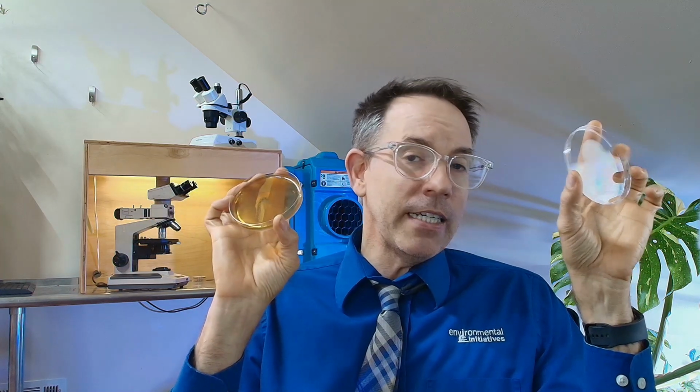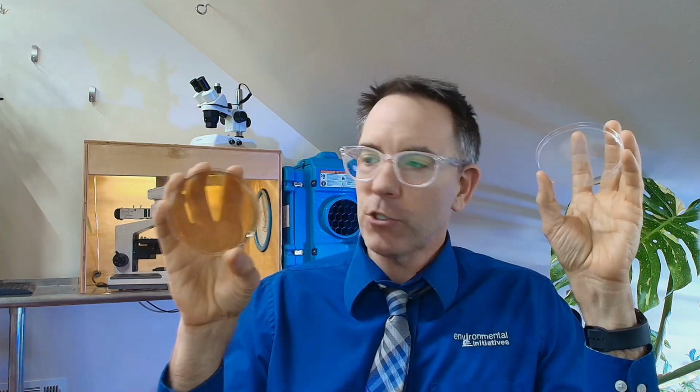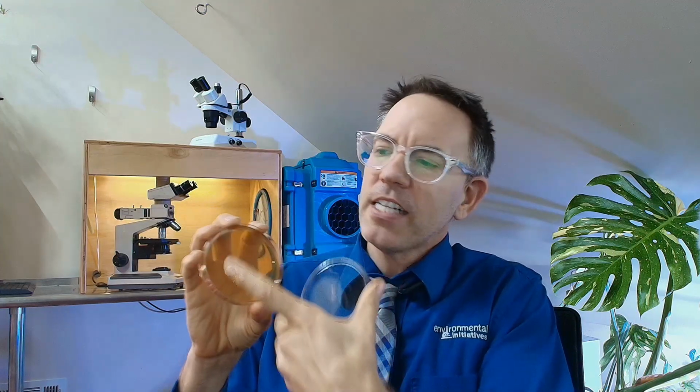Okay, so normally when a person's going to take samples for sewage bacteria, they're going to be using a sterile swab and sterile water. They'll wet the swab and they'll swab the surface and send that swab to the laboratory. The laboratory will then extract the bacteria off the swab and put it onto a petri plate. Now, granted, there is DNA type of testing for sewage, which is pretty cool, but we're not covering that here. We're talking about the culture methods. So they then extract the bacteria, put it onto the petri plate, and then over a couple of days, the bacteria colonies will grow.